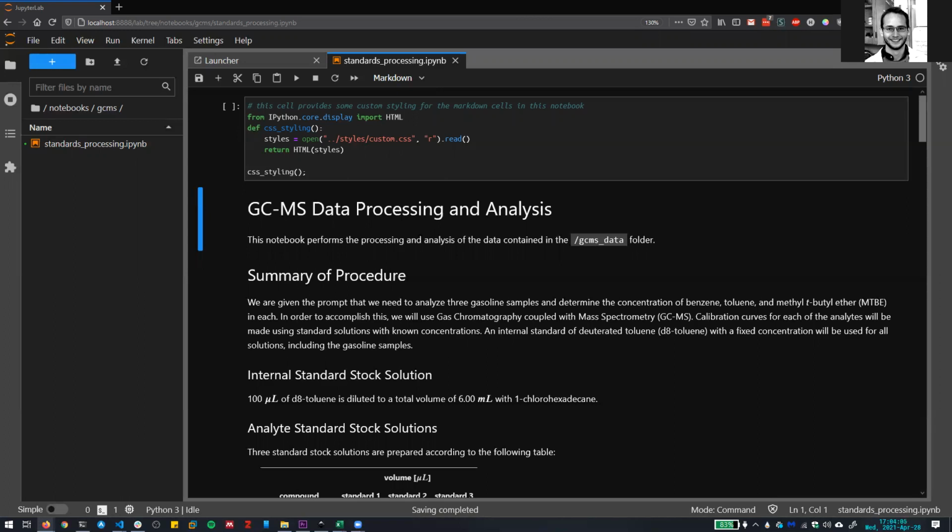It's the same process as we did on Monday, where you just click on that green download button and then download a zip file. I don't really want to start going through this until you all have it open so you can follow along with me.